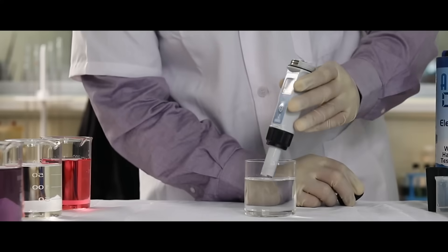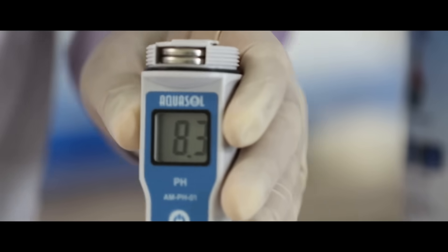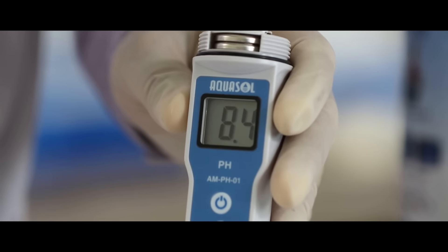Once all pH values are calibrated, we can test the samples. Dip the electrode in the sample. Stir gently for a stable reading and note the reading.